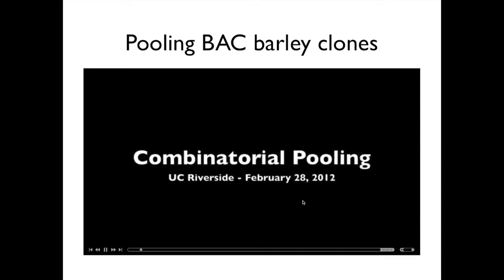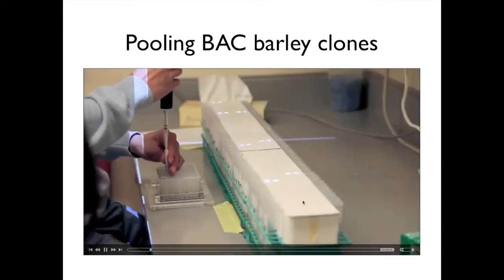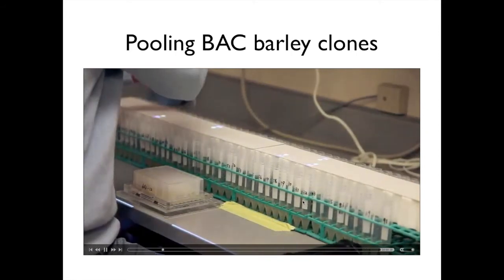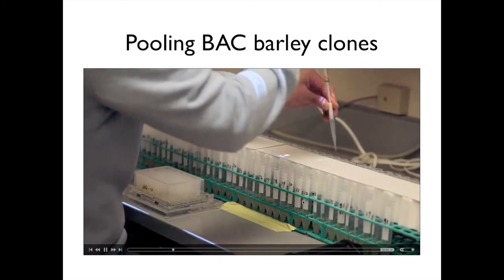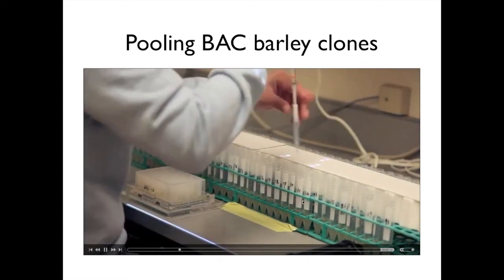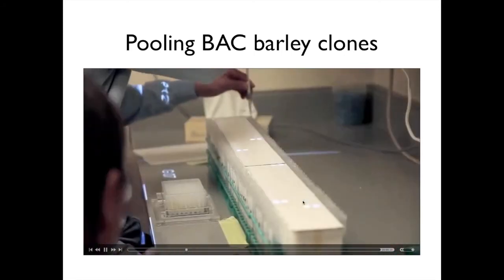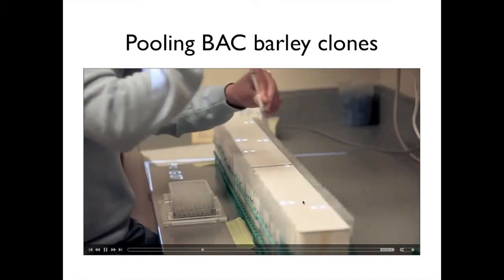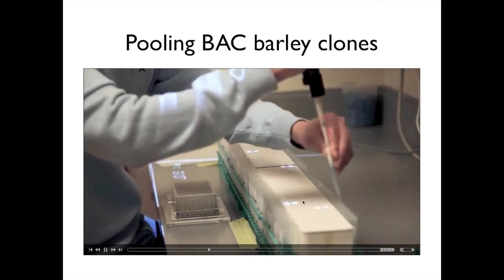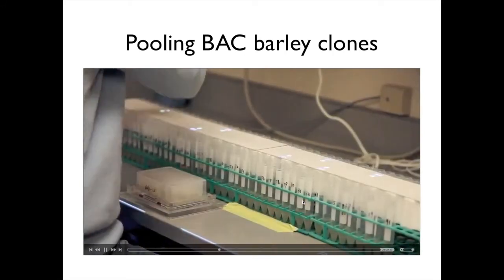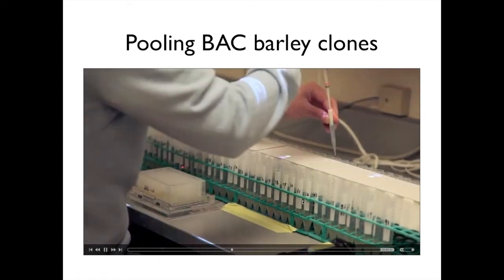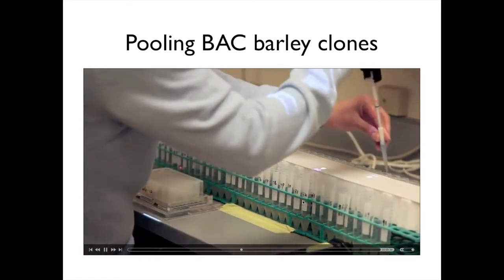So now we go on to a little video that lasts roughly two minutes. This is the combinatorial pooling in action. Here again is the 96 wells and you see the lights are in a certain position that mark the target wells. A person sets the pipette down, picks up a new one, takes an aliquot, aliquots to the next seven pools. These are standard 15 milliliter screw cap plastic tubes in test tube racks, just fastened into position with a piece of tape so they don't move during the pooling.